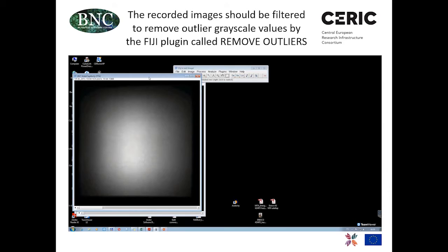Such outliers can come from the so-called dead pixels, when one pixel is malfunctioning and is not able to record the proper value of the information. So then it is either completely zero or completely full. These dead pixels should be treated as an average of the neighboring pixels.